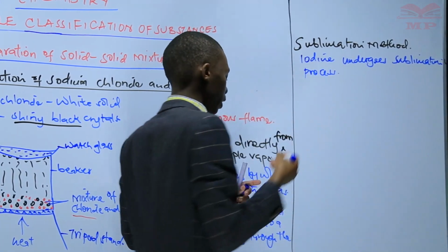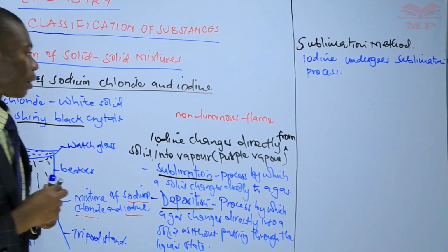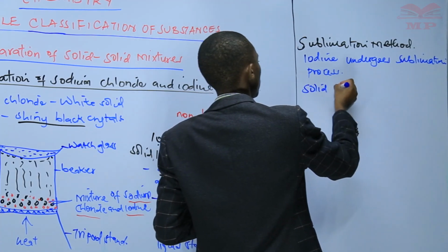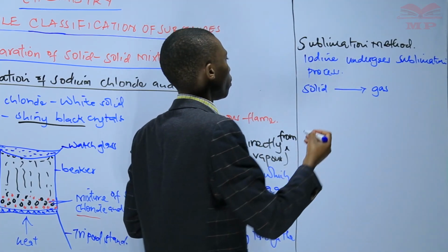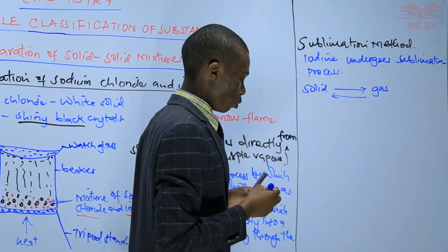Therefore, we can say that iodine undergoes the sublimation process. Sublimation just means from solid to gas. Then from gas to solid, this is what we are calling deposition.